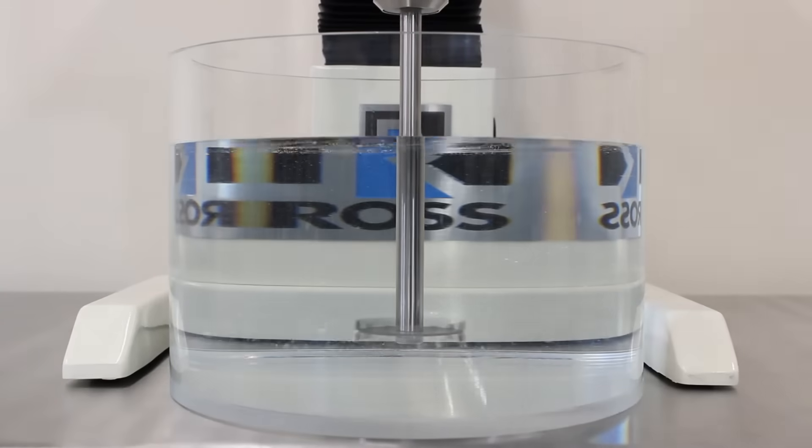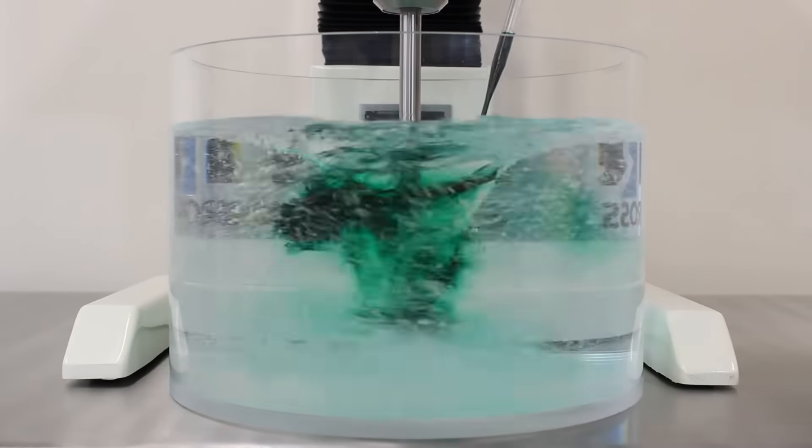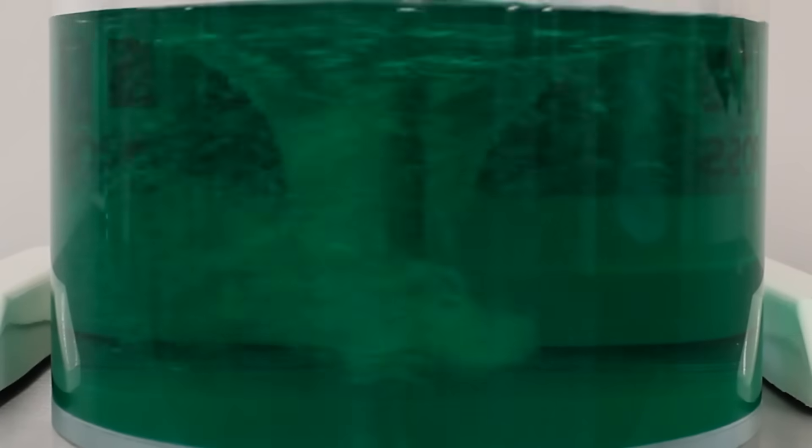An interchangeable high-speed disperser attachment is used for applications requiring deep vortices in higher viscosity products.